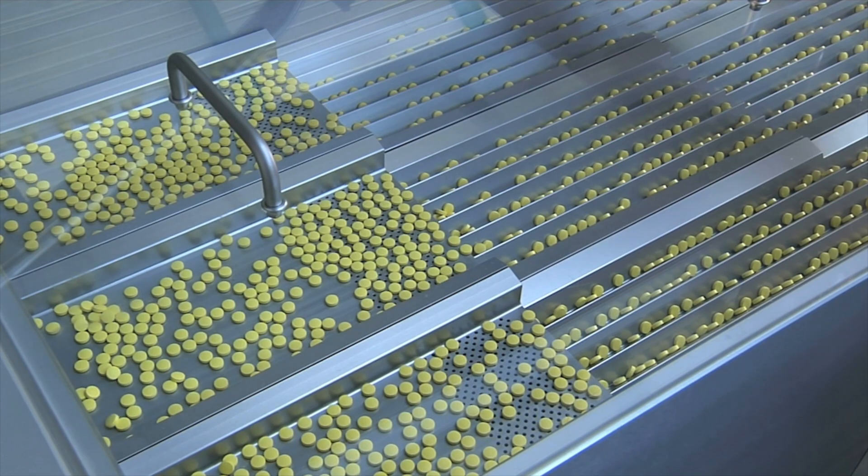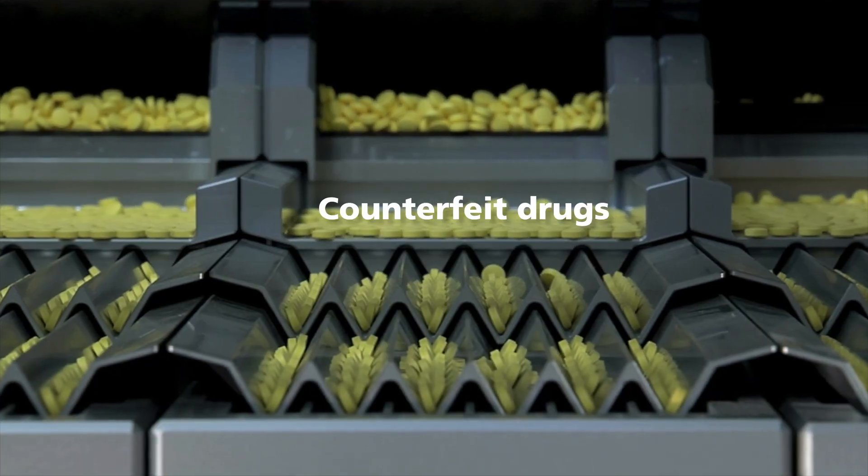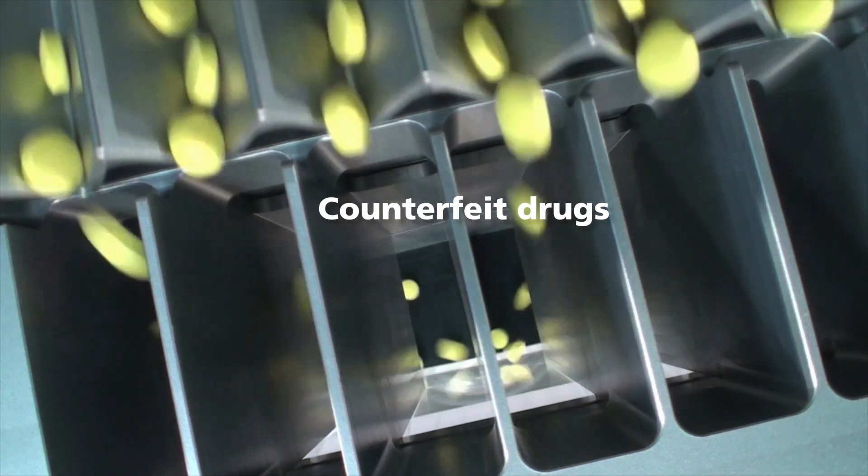It's positive for methamphetamine. Pharmaceutical manufacturers can quickly identify counterfeit drugs on site.